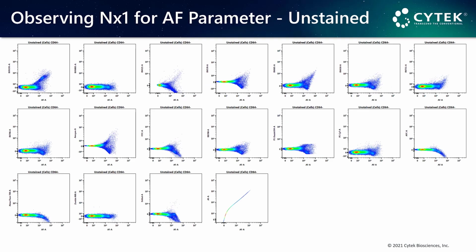Like before, we investigate the unstained sample to determine which unmixing choice is best. When comparing unmixing with and without autofluorescence extraction, high autofluorescence samples will be significantly improved by unmixing with autofluorescence extraction. And in this case, we have unmixed with autofluorescence extraction enabled, and we're observing that AF tag versus every other fluor in the assay. Here you can see the significant variation in the autofluorescence fluorochrome, and we are not observing nice rounded negatives. If the sample is heterogeneous like this, we want to refine our assay and we want to include extra fluorescent tags to represent that heterogeneous autofluorescence.